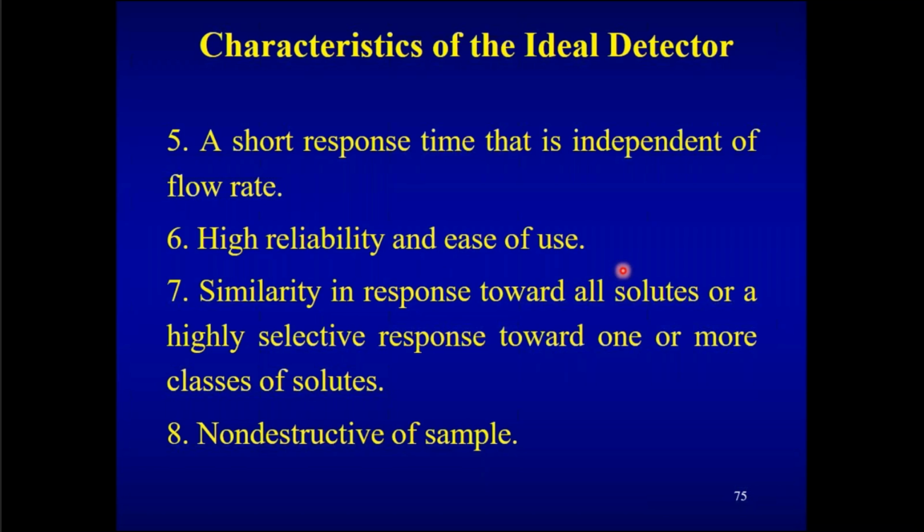High reliability and ease of use. The detector should be easy to use, in how it operates, and the response that it gives must also be very reliable. That means the response should be proportional to the amount of the component that is present. There should not be any addition or reduction in the response due to some feature of the detector.